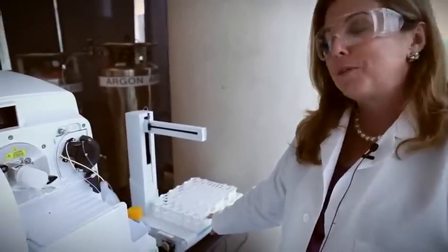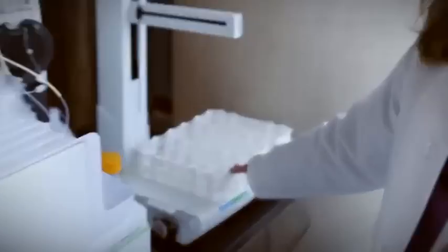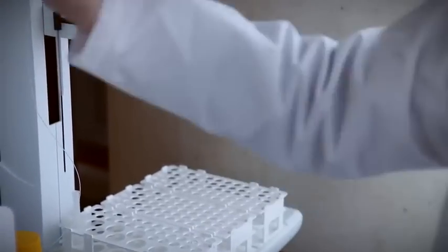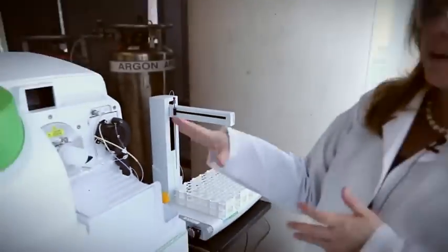So we start off here, a really important instrument for scientists, especially if you're doing a lot of samples, is an autosampler. You can load up a hundred samples at once. You're going to suck the material out of the sample, put it into a nebulizer, create a spray which enters a plasma that heats the samples again to very, very high temperatures.